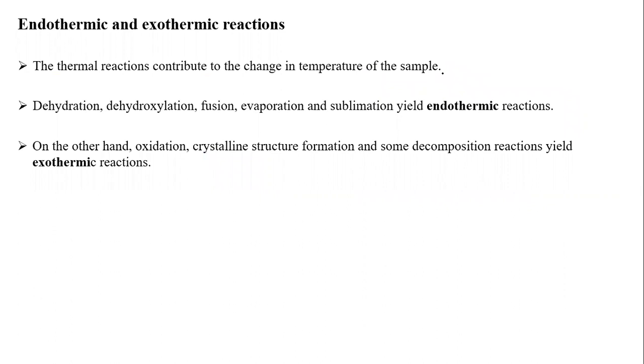So what are endothermic and exothermic reactions? We will read about this. Thermal reactions contribute changes in the temperature of the sample. Generally, dehydration, removal of water, dehydroxylation, fusion, evaporation, and sublimation yield endothermic reactions. On the other hand, oxidation, crystalline structure formation, and some decomposition reactions come under exothermic reactions. So these are a few types of reactions involved in endothermic and exothermic reactions.